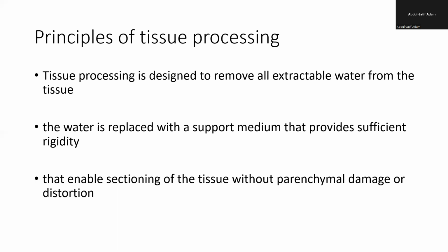Along the way we'll talk about frozen sections. In this case, it is water that has been removed from the tissue, and this causes some hardness to the tissue, and this hardness enables sectioning of the tissue without damage or distortion.